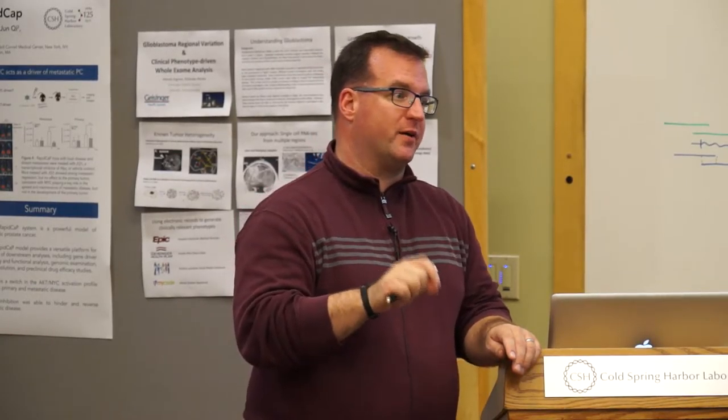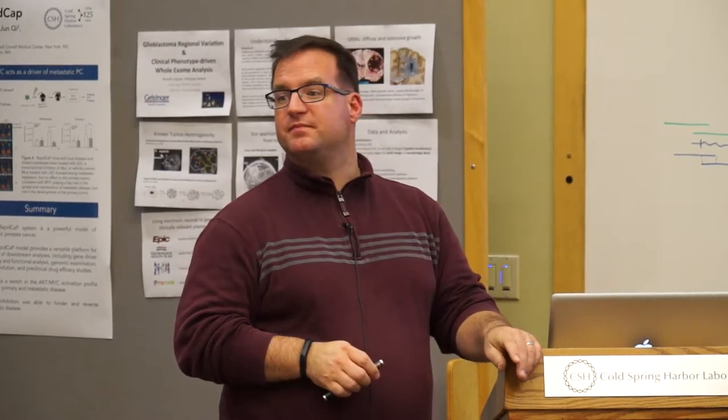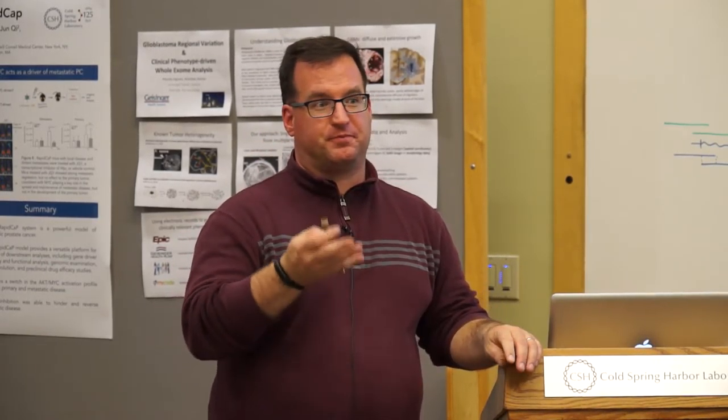Obviously, the human genome has an awesome assembly to use, so you can map your reads. Something that doesn't have a reference, you don't have any reference to go by either. That's right. And because this is sequencing by hybridization, by definition, it required a reference. So you could never have used this technology to sequence a new genome. Okay. Why did they kill it? I don't know. Anybody familiar with this story? No?